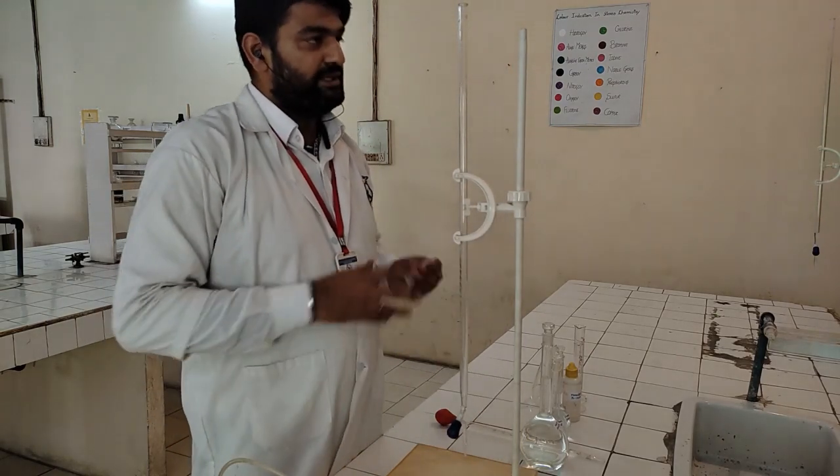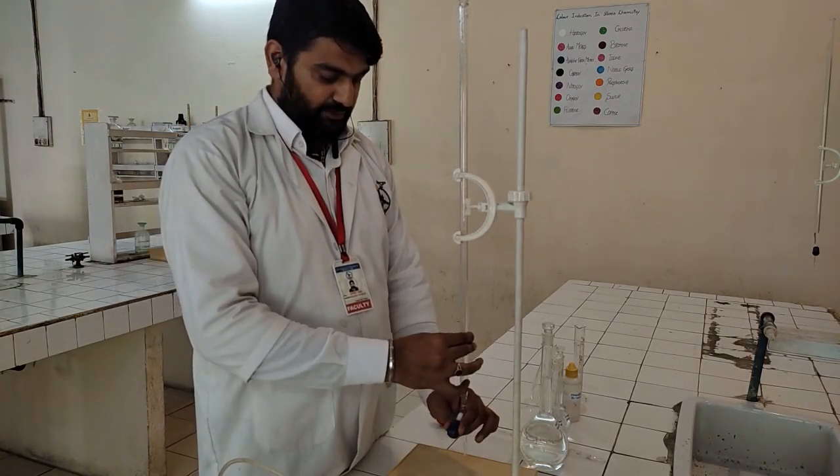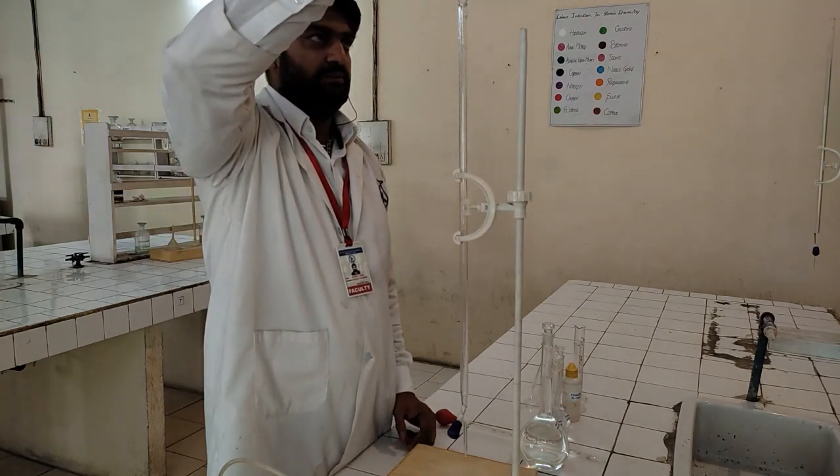Now place a funnel at the top, close the tap and fill the burette with the standard solution.